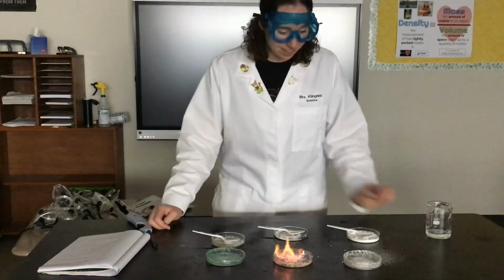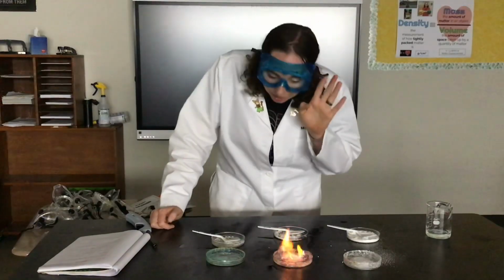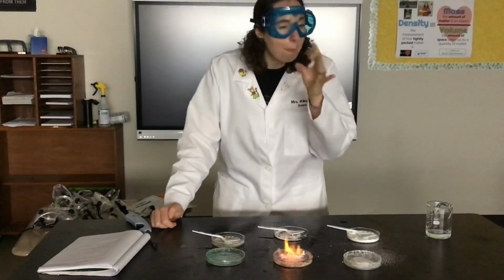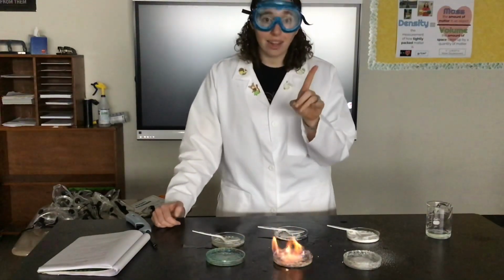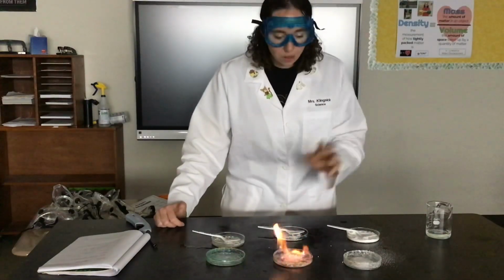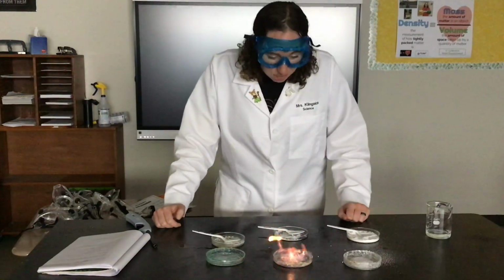Isn't that cool? That one went out. Now, you can't really see it, but I can hear it and I can see it. There are bubbles being produced. Now, we know when there are bubbles, as scientists, that means that what is being made? A gas. And so, because now I've seen a color change, and there's gas being created, I for sure know that a chemical change is happening right now. Super cool.